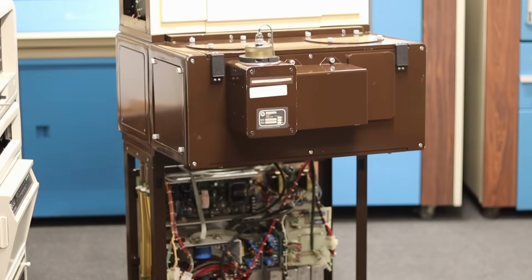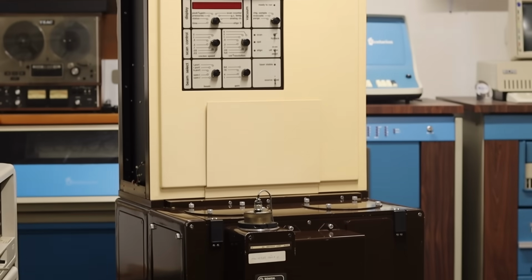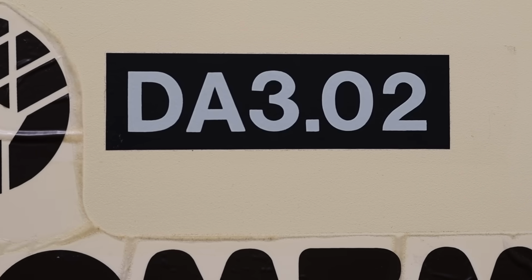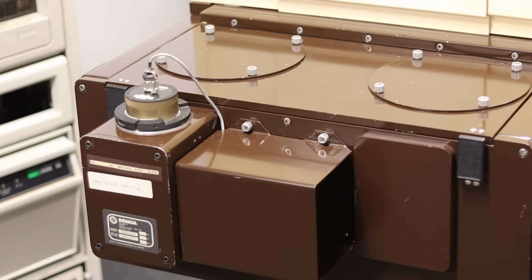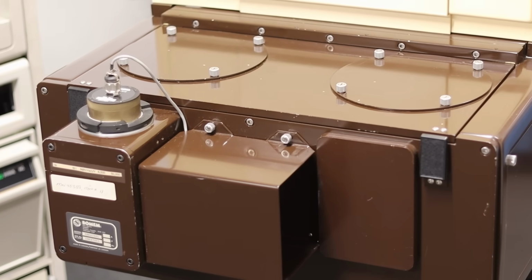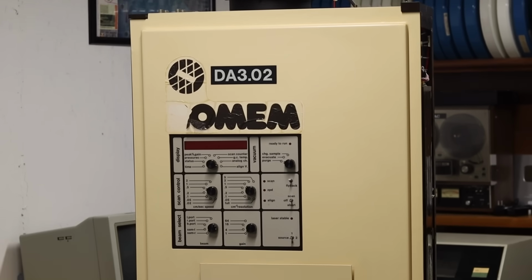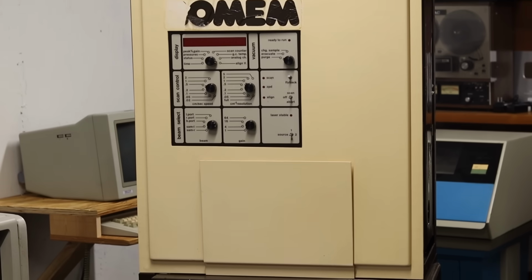So if we want to do real deal proper science, we're going to need a better emitter, a better detector, and a proper computer. This is a Bomem DA3 Fourier transform infrared spectrometer. If our human-based spectrometer is a Huffy with training wheels, this thing is a Ducati 996R. It is the best of the best. And even though this one was built in about 1985, it is still one of the best high-resolution infrared spectrometers on the planet today. This is an incredibly special machine.